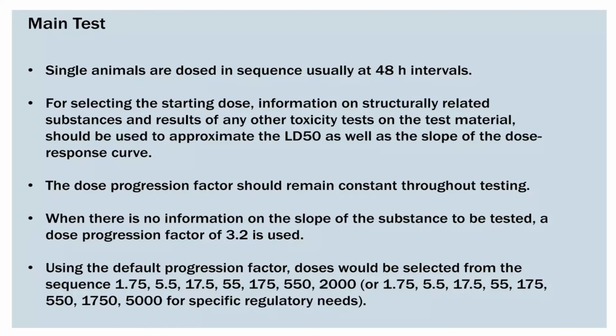After recording the long-term outcomes for the animals, typically after 2 weeks, the LD50 estimate and confidence interval may be calculated. The dose interval should be 48 hours between two doses.